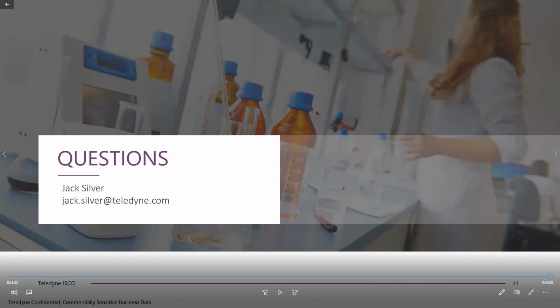The gradient is good at eluting compounds, and if you have compounds that are very, very well resolved with a lot of space between them, the gradient is very good at reducing the resolution between those two peaks if you needed to.